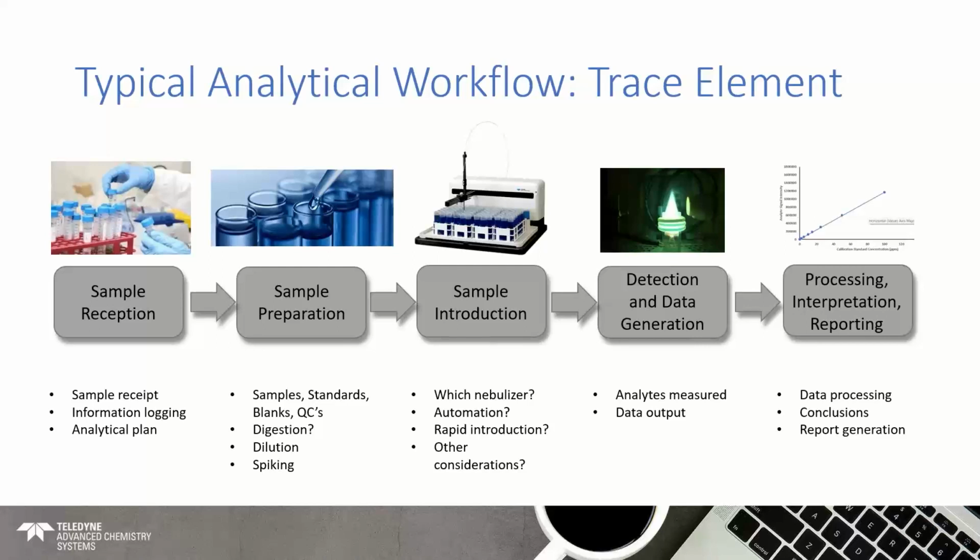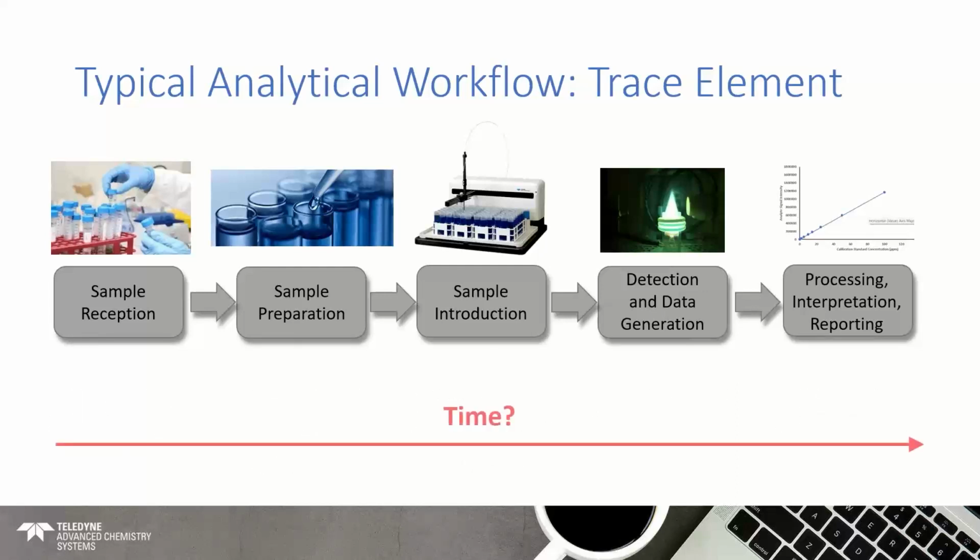So your data output is then taken, it's processed into whatever form that you want it to be in, the data is interpreted, and then you do your reporting and generate your conclusions from it. So that's the full workflow. There will be other nuances between these as well, other considerations to factor as you go through that workflow. The key thing here is that there are numerous aspects between your sample receipt and the data that you receive at the end of it. And all of that takes time. There is quite a large amount of time between A and B, start and end of this process.